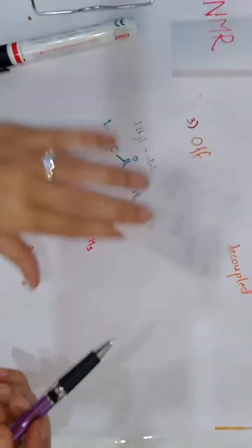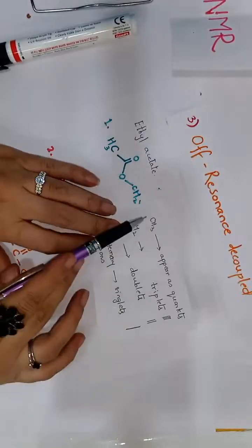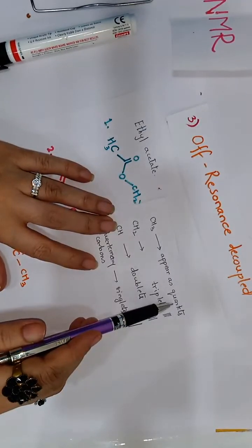We will refer to this chart. CH3 appears as a quartet.